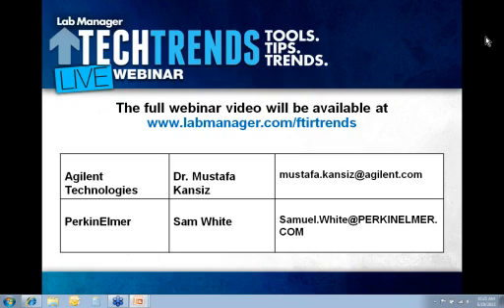Yeah, I'd have to agree with that. Certainly, smaller instruments are actually demanded by customers these days. Ease of use, the single bounce ATR, which was invented years ago, but has just been widely, universally accepted as the sampling technique in the mid-infrared. It's incredibly simple. We all have them. They all work very, very well. You can either go with a diamond crystal that'll last forever or something like zinc selenide or germanium that'll wear out in a couple of years. But basically that is what customers are asking for, and then of course software to be very easy to use.